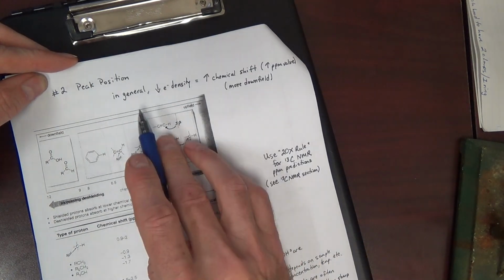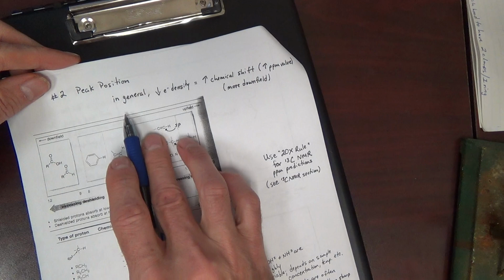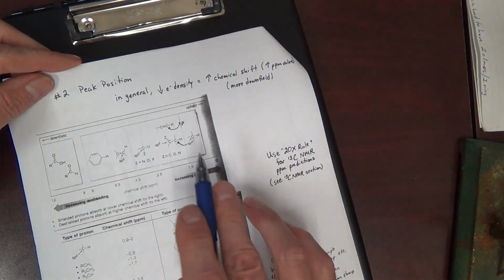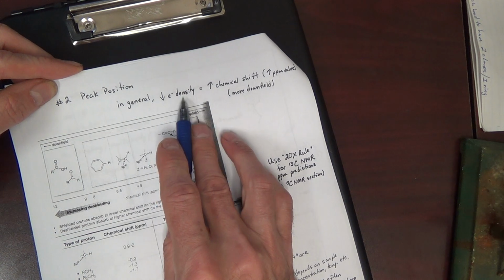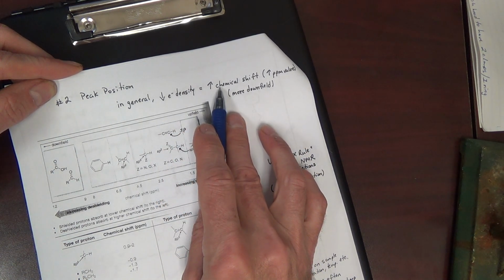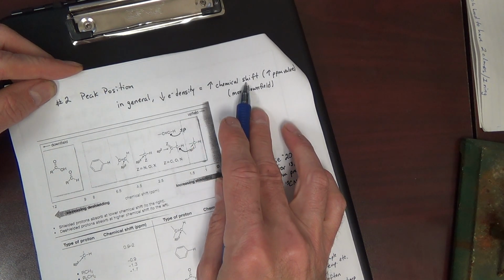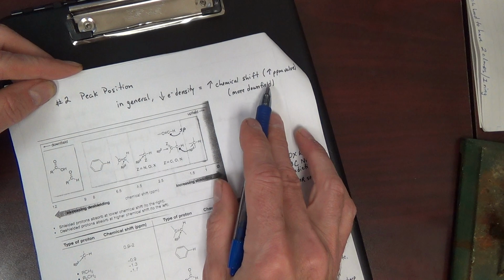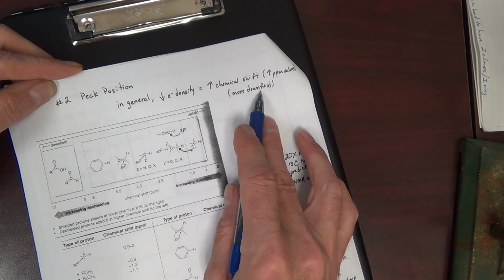Remember shielding, deshielding? Let's make a statement about that. Working statement: in general, lower electron density is going to equal higher chemical shift, or delta value, or ppm position. And a higher ppm value is going to be more downfield.